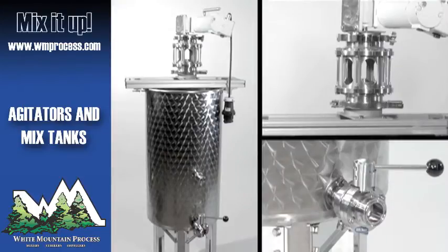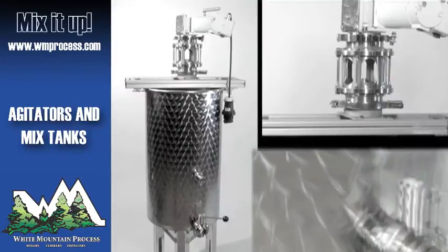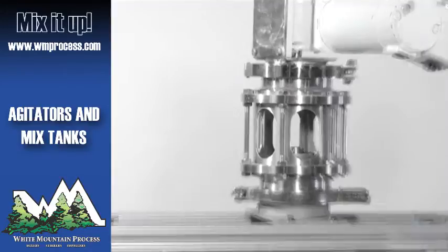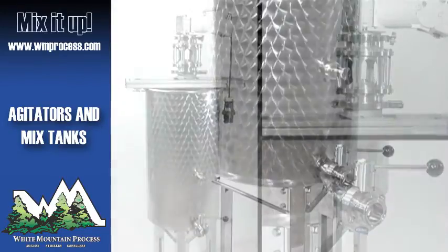White Mountain Process specializes in sanitary mixing tank packages. We offer industrial and ultra sanitary agitators integrated with plastic or stainless steel process vessels. CGMP document packages are standard, and we understand the need for mill test reports and USP6 documentation for biopharma applications.